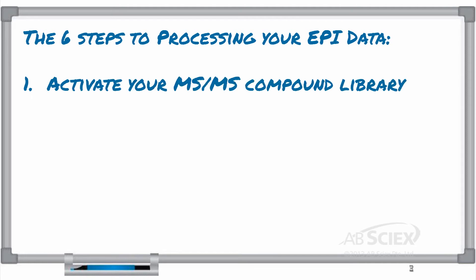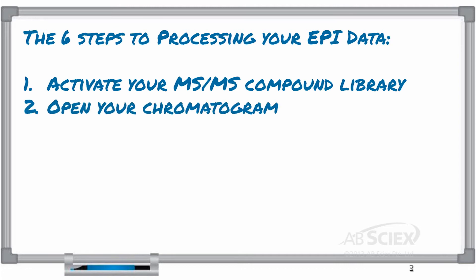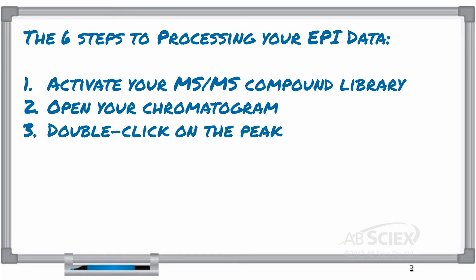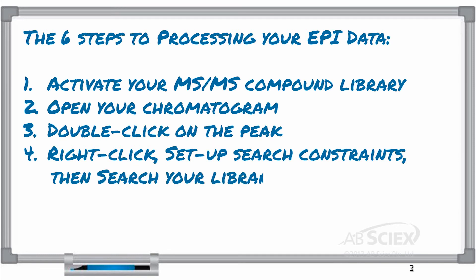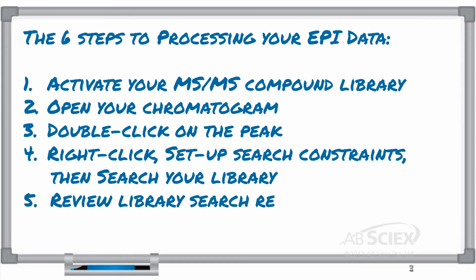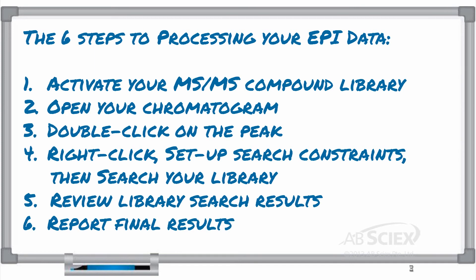Step 1: Activate your MS-MS compound library. Step 2: Open the chromatogram file for your sample of interest. Step 3: Double-click on the peak of interest. Step 4: Right-click in the EPI pane, set up the search constraints, then search your compound library database. Step 5: Review the library search results. Step 6: Report your final results.